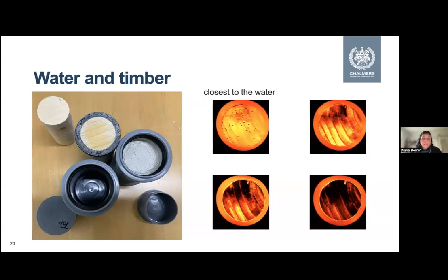Then in the same collaboration, there is another research question. When you have timber and you add concrete on top, if water is going to be taken up by the timber, then there will be less water for the concrete to harden. And it will also impact some mechanical strength, because the wood will swell. So here we had to build a rig again, to keep this in place, make sure that water is not moving where it shouldn't be, and also to add the concrete.